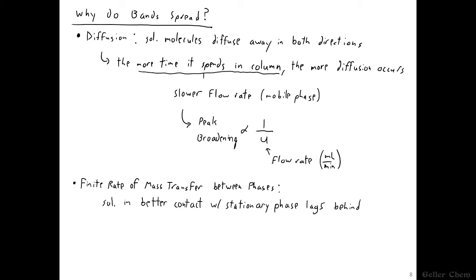In this case, broadening is worse as the flow rate speeds up. Broadening worse as flow rate speeds up.